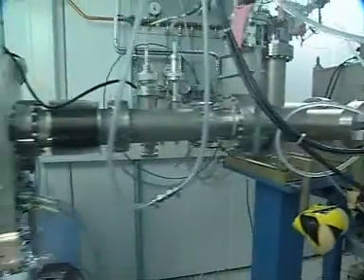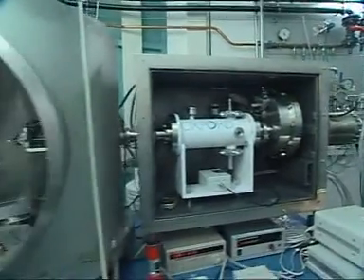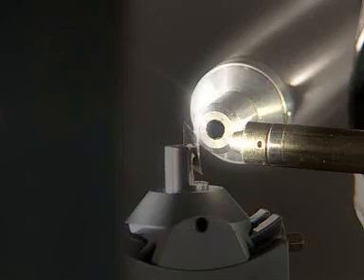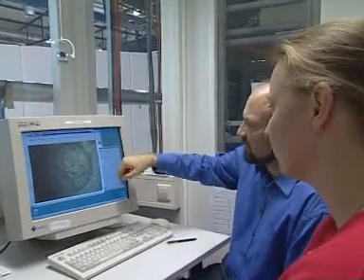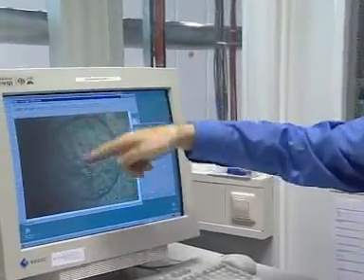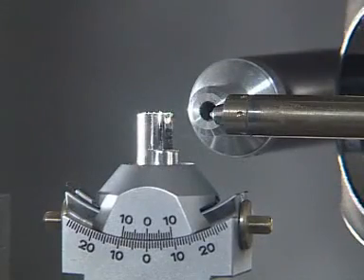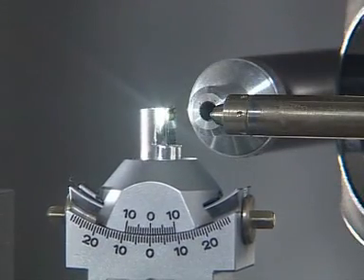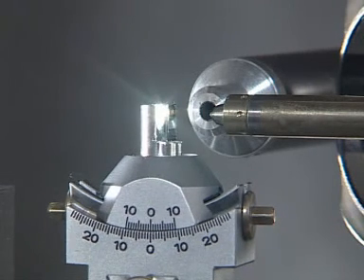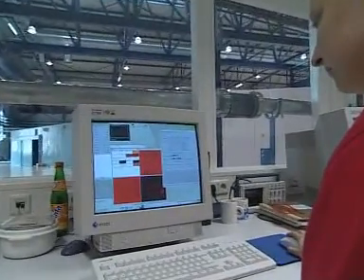The range of measurement is explored on the image of the light microscope installed in the measuring station. The X-ray is focused by a capillary to a small spot only a few micrometers in size, and the characteristic fluorescent radiation is captured by the X-ray detector and evaluated in the multi-channel analyzer. The sample is scanned and the fluorescence data are obtained point by point in this step. The measured data produce a two-dimensional representation of the trace elements studied in the sample.